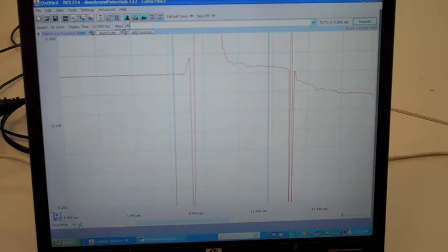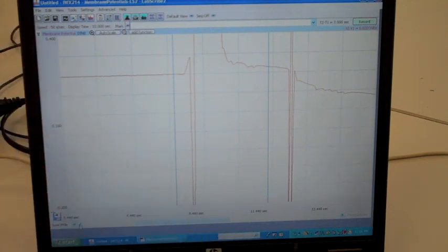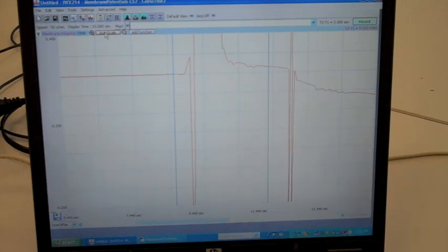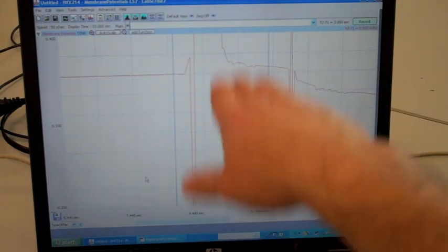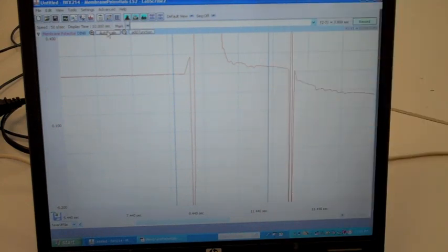When you're acquiring data, this same set of rules applies. If the software is narrowed on a very narrow range, you won't actually see your data as it's being collected. In order to see it, you have to have the correct voltage potential set on the side. And while the directions from the manufacturer will tell you to use the auto scale function, the auto scale, again, only judges based on what it's looking at currently. So in this case, while we've got a huge range, if I use that auto scale function, it'll bring that all nicely into range.